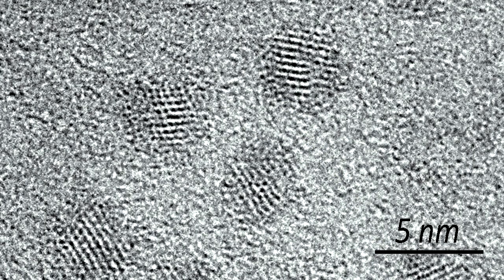Transmission electron microscope images of the synthesized zinc telluride will show them being roughly spherical with a diameter of about 3 nanometers.